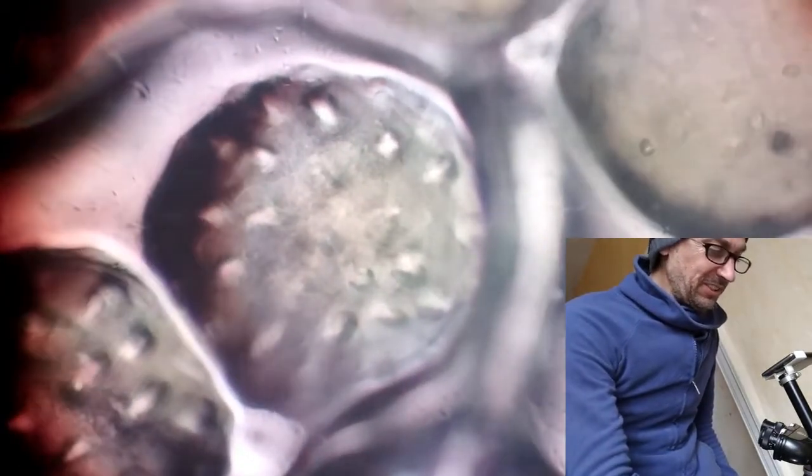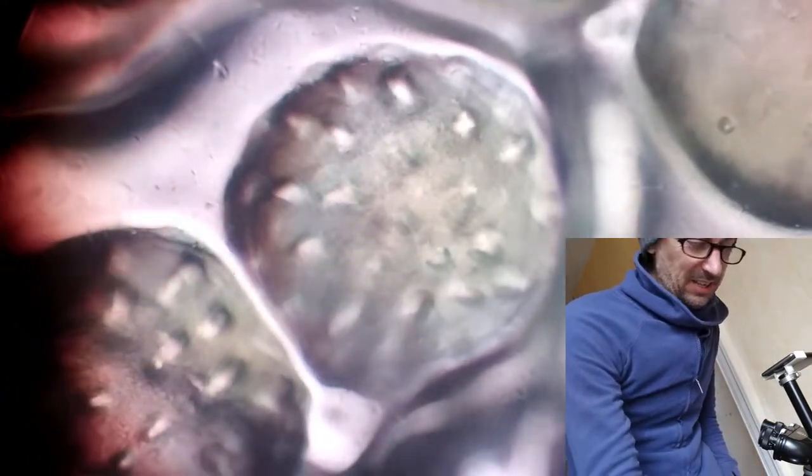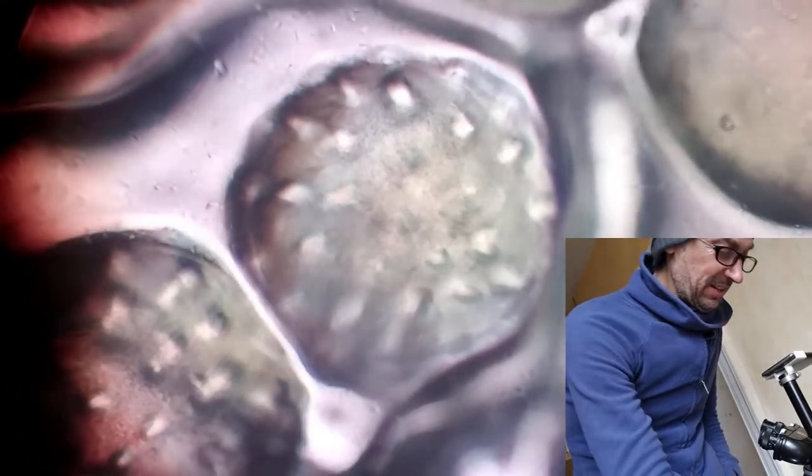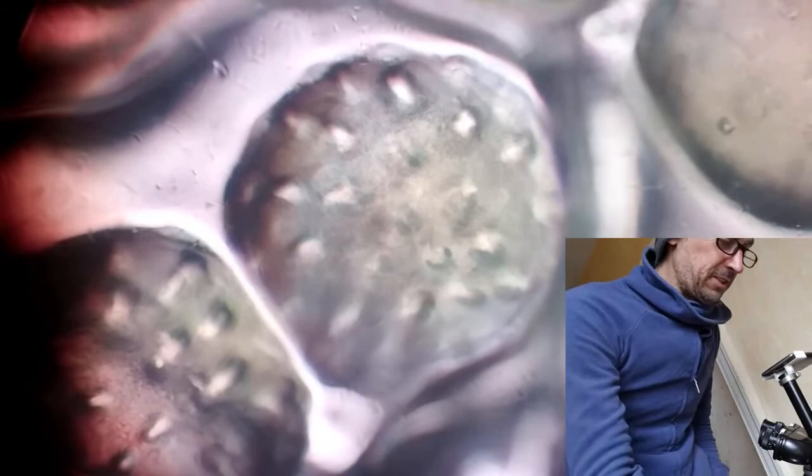400x - 40 times 10 - would be way enough to identify. I have dark field somewhere, but I never really did the phase contrast.